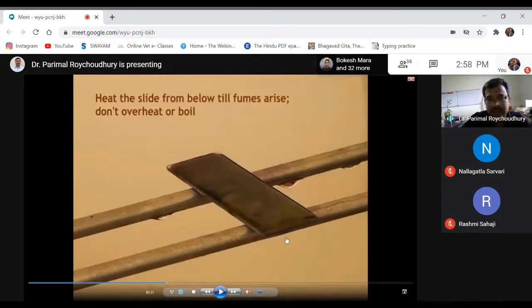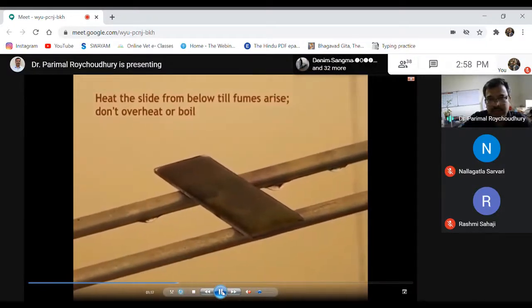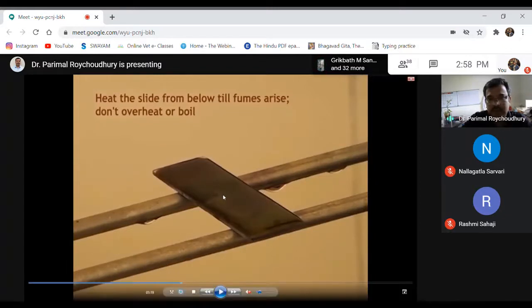Likewise, we can heat it up to 3 minutes, and then the bacteria will take the color. By applying heat during this particular stage, the mycolic acid or the waxy component becomes permeable, and the stain will penetrate inside the mycobacteria.